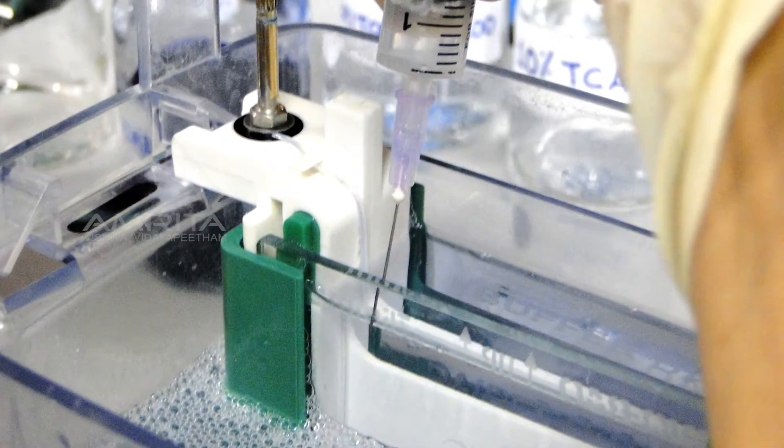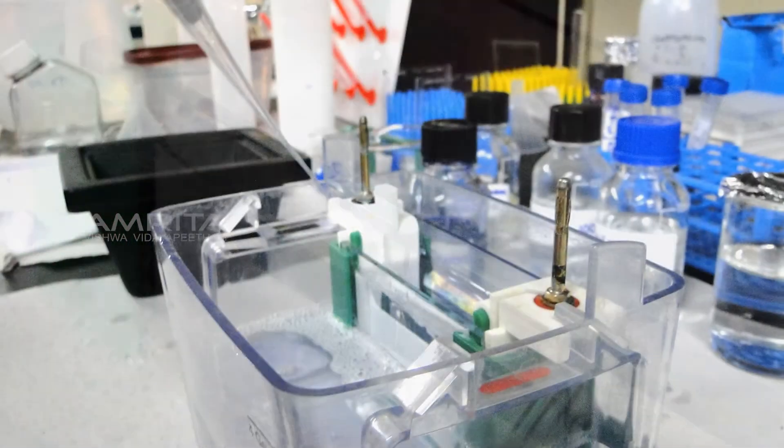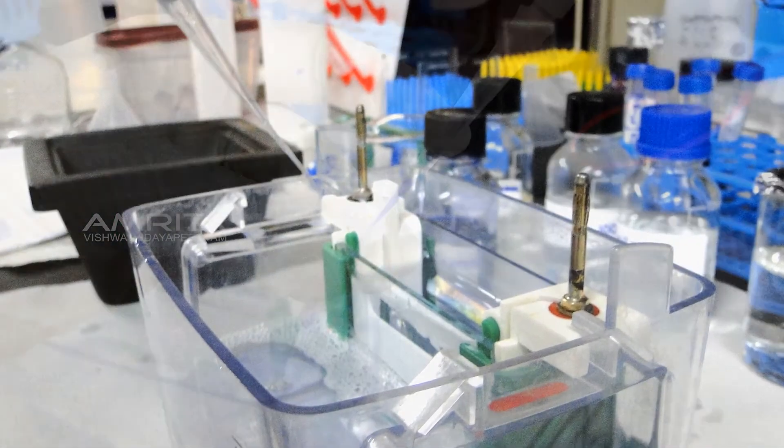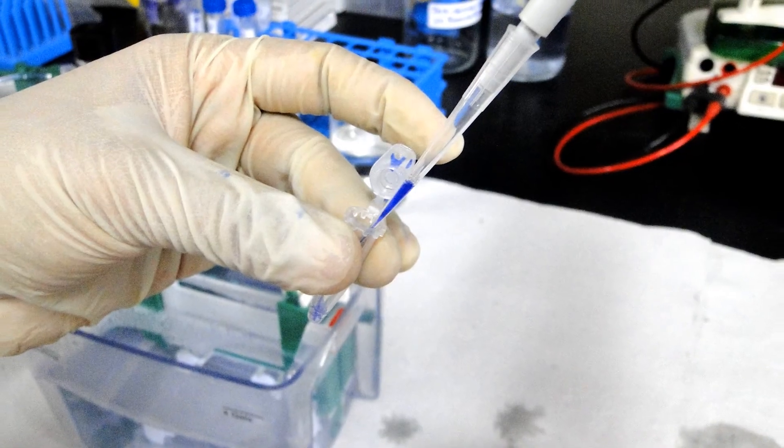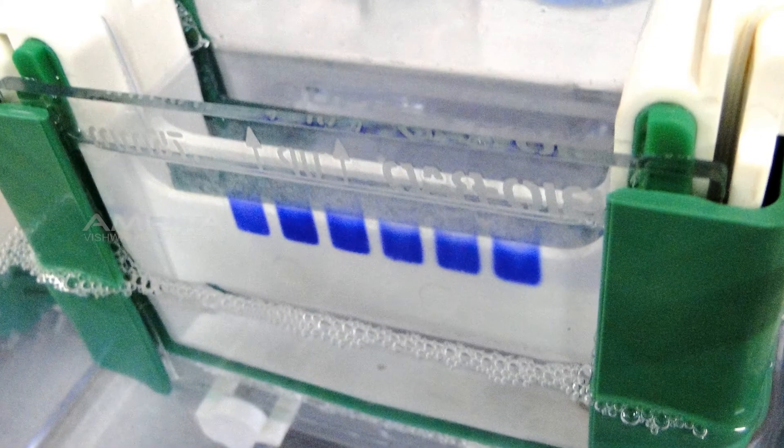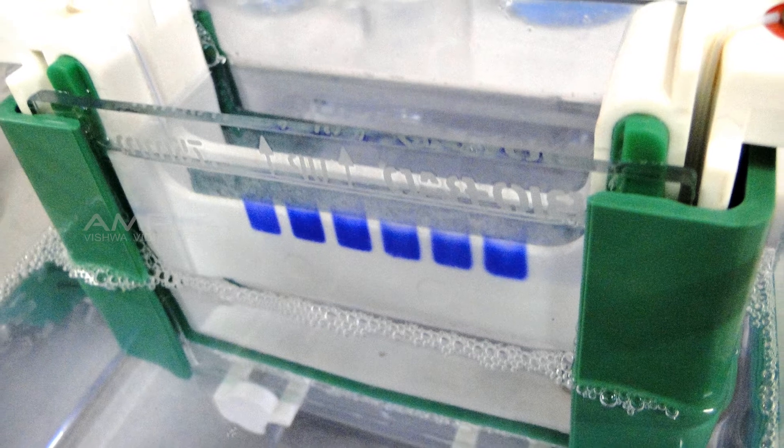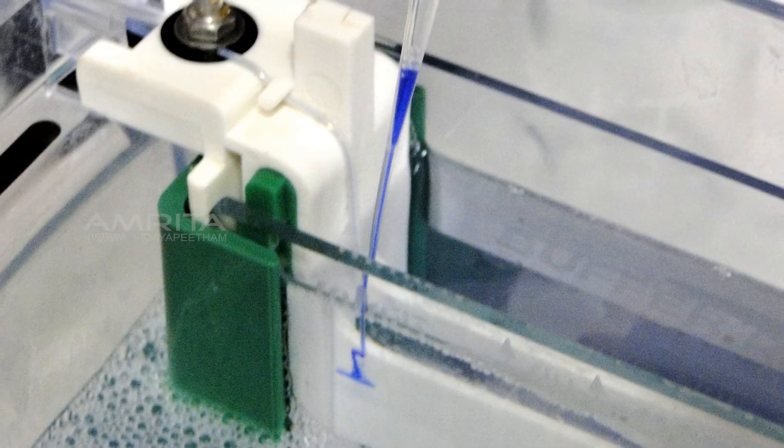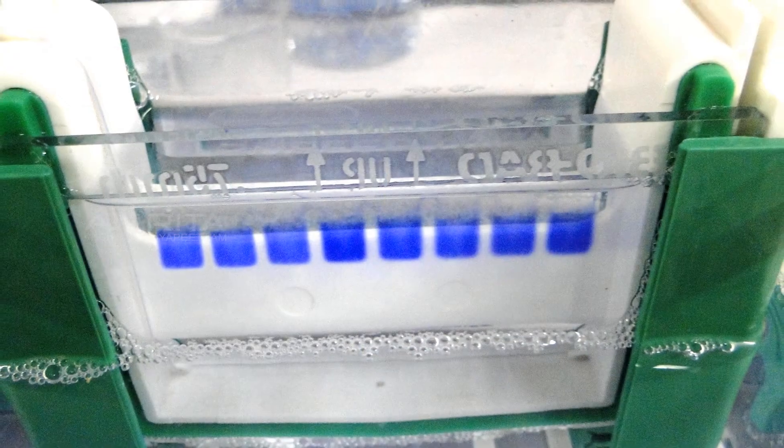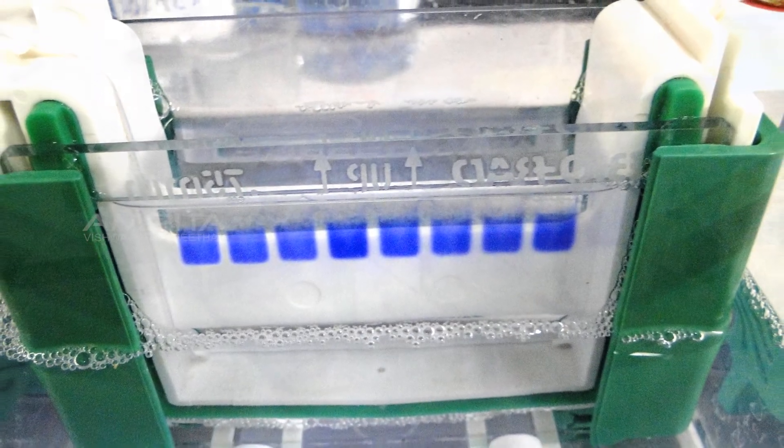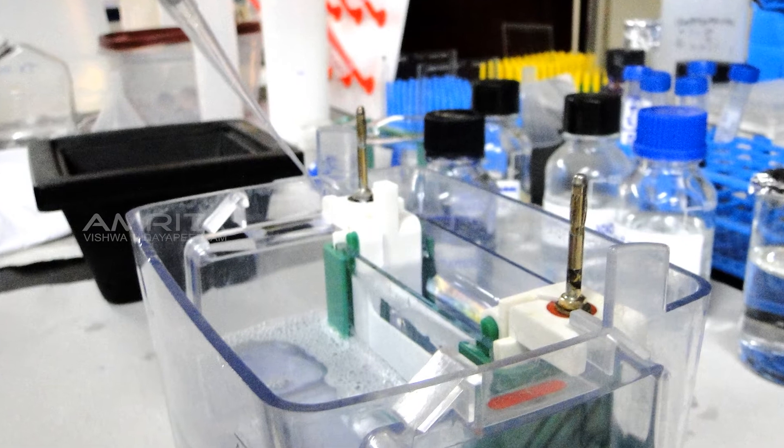Rinse the wells with 1x running buffer using a syringe. Rinse the loading tip with buffer. Samples can now be loaded onto the gel. Deliver 20 microliters of the protein sample into the well carefully by inserting the tip a few millimeters from the well bottom without breaking the wells. Rinse the loading tip with the buffer after each loading.